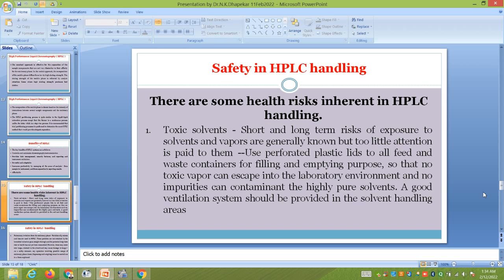You can get a lot of research papers on this topic. And those who are from a civil engineering background will know the importance of detection of toxins in sewage. Then detection of toxins in water to study the quality of water is also done with the help of HPLC.